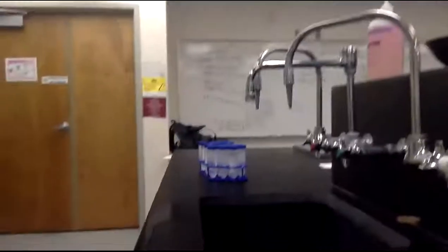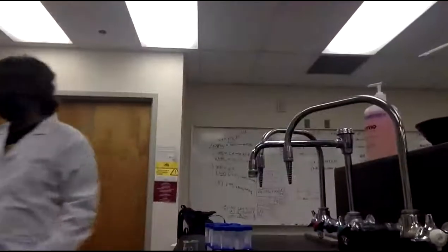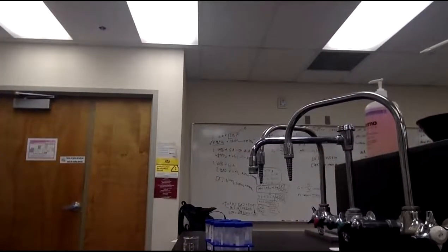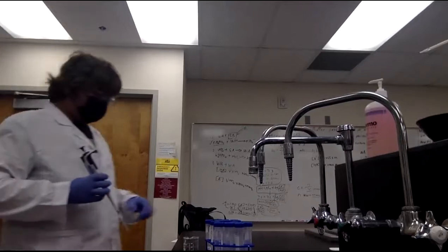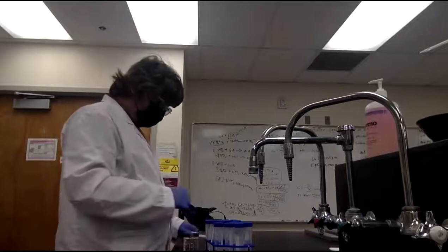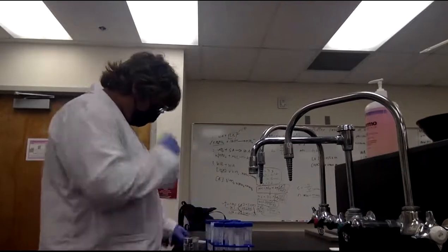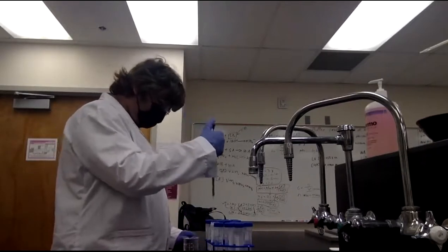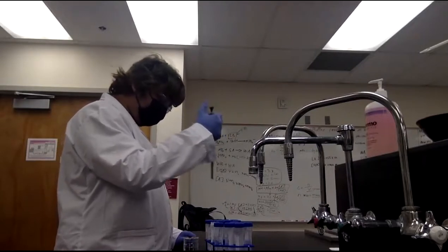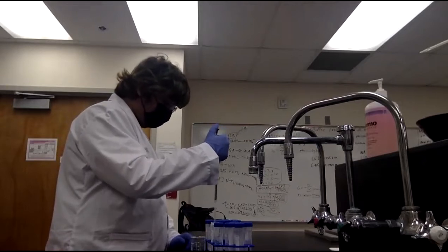I measured the acid. I'm gonna do this twice with 1 milliliter, then do a singular point later on.